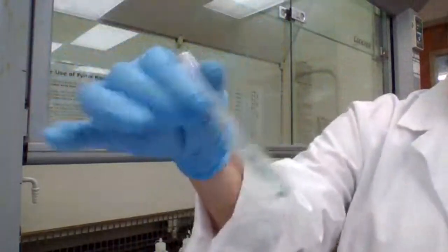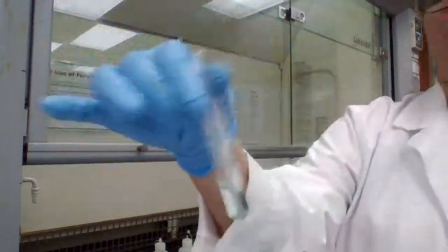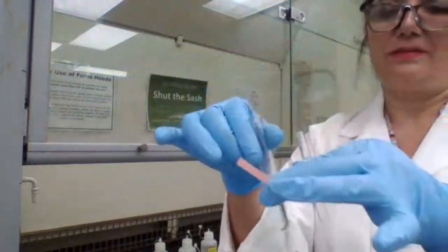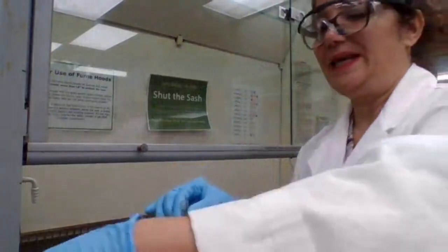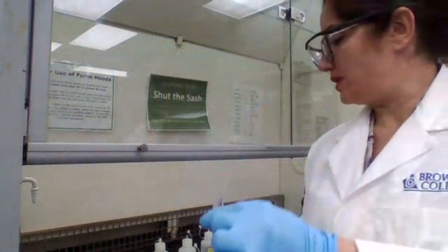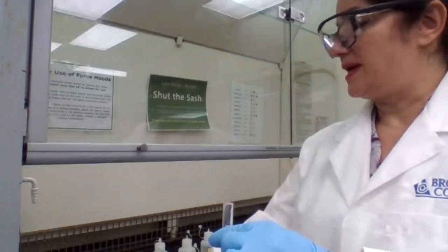I have to mix it well. It disappeared because the solution is not basic yet. Once the solution turns basic, the precipitate will form and stay.